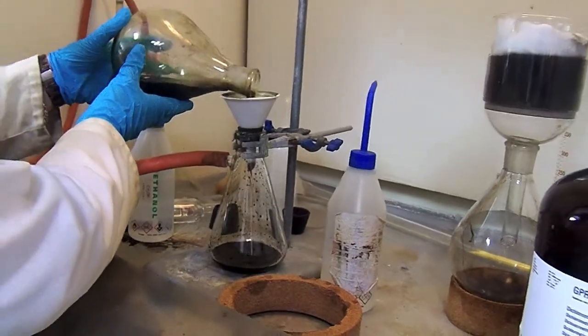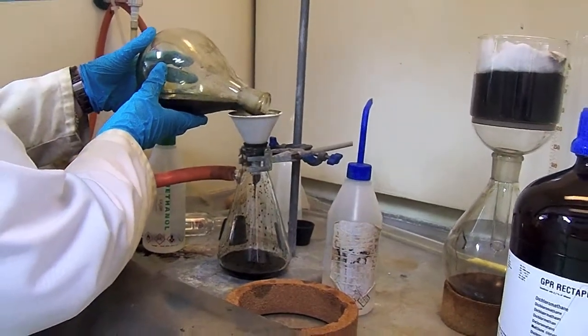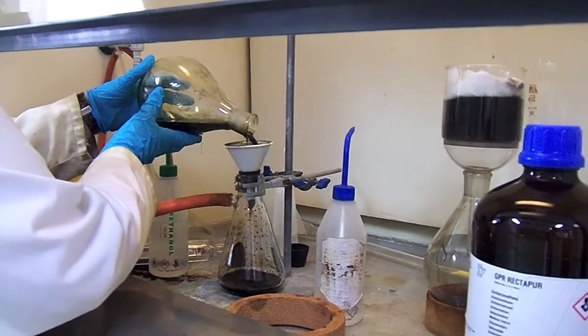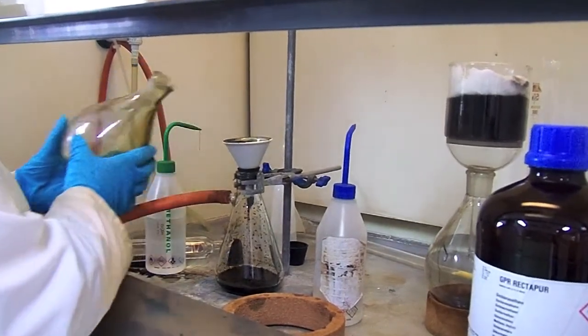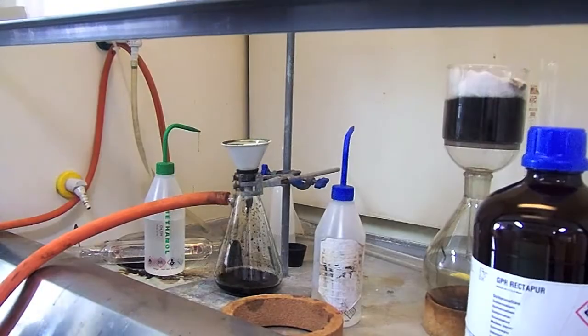Filter your precipitated porphyrin product into a suitably sized Buchner funnel using additional methanol to wash the porphyrin if necessary. After precipitation you will end up with a lovely purple solid which you can put into a sample vial to dry.